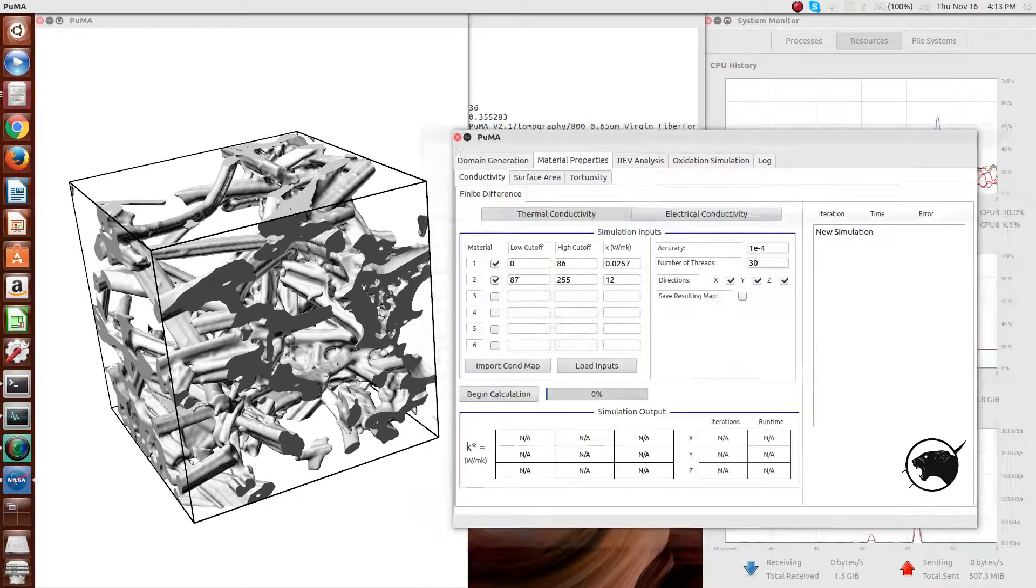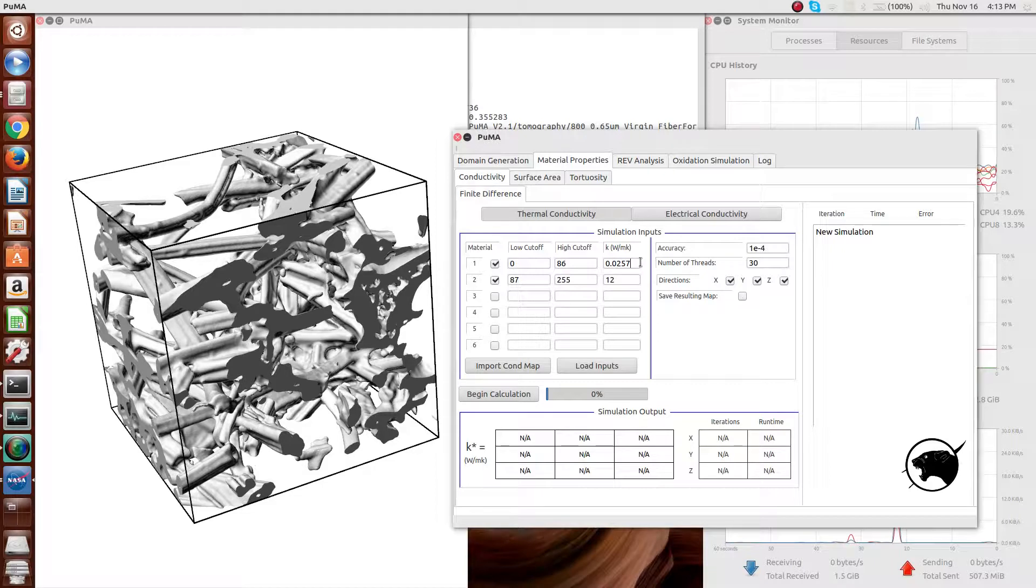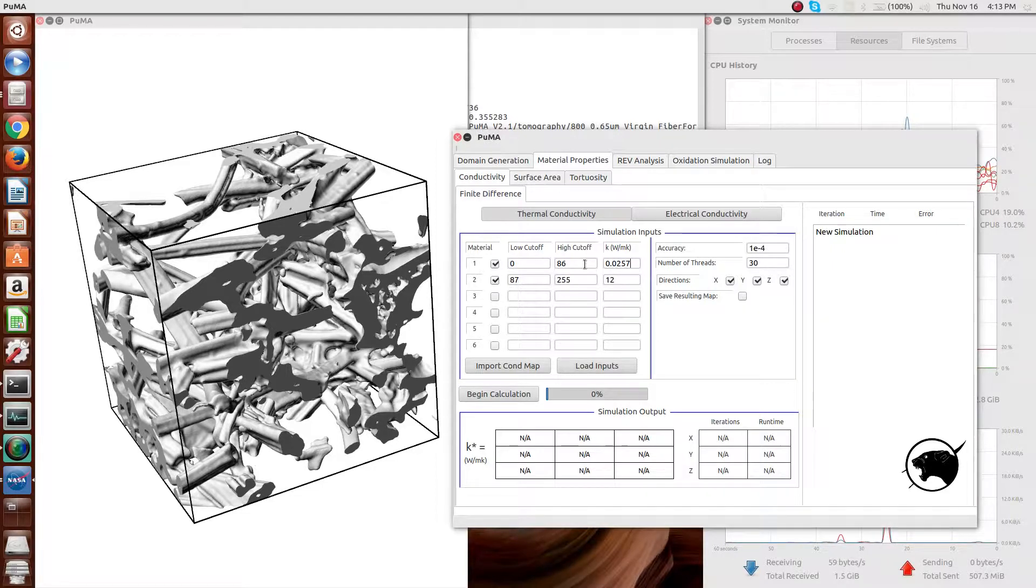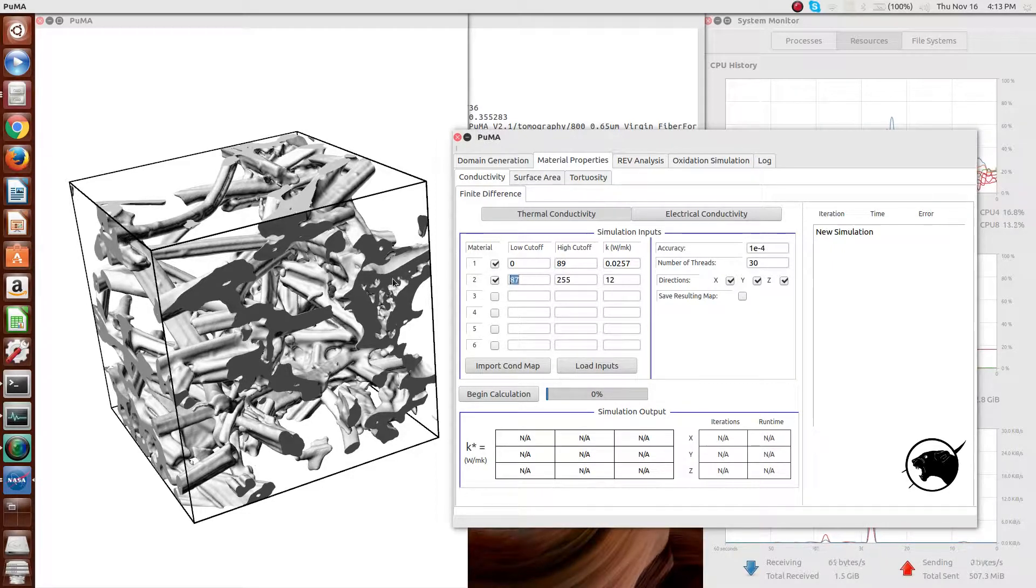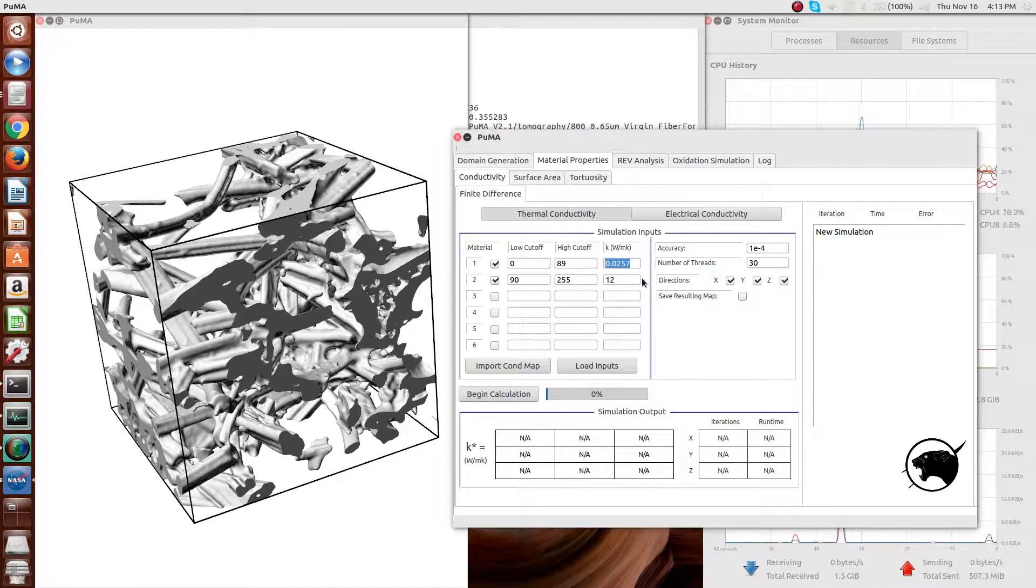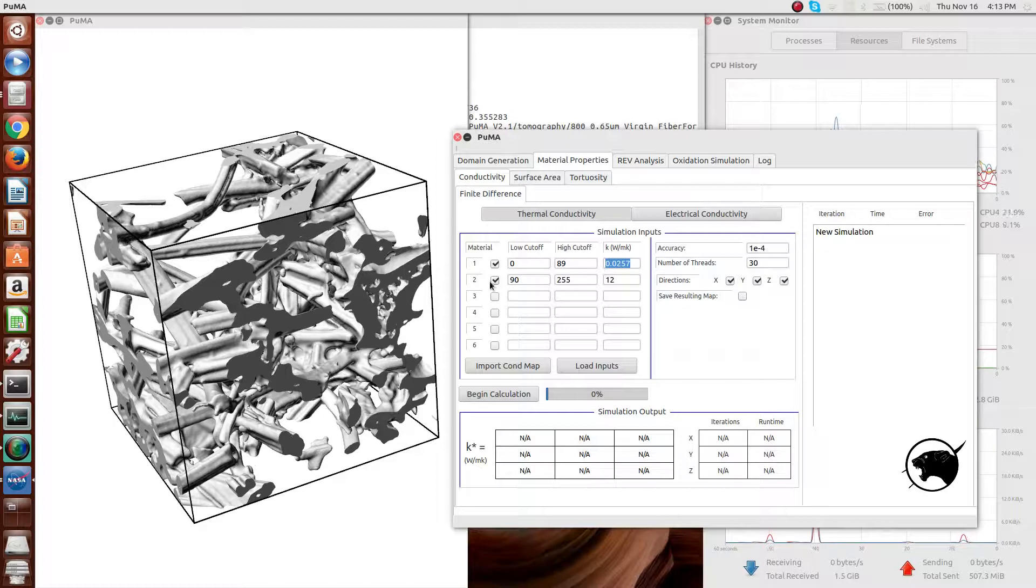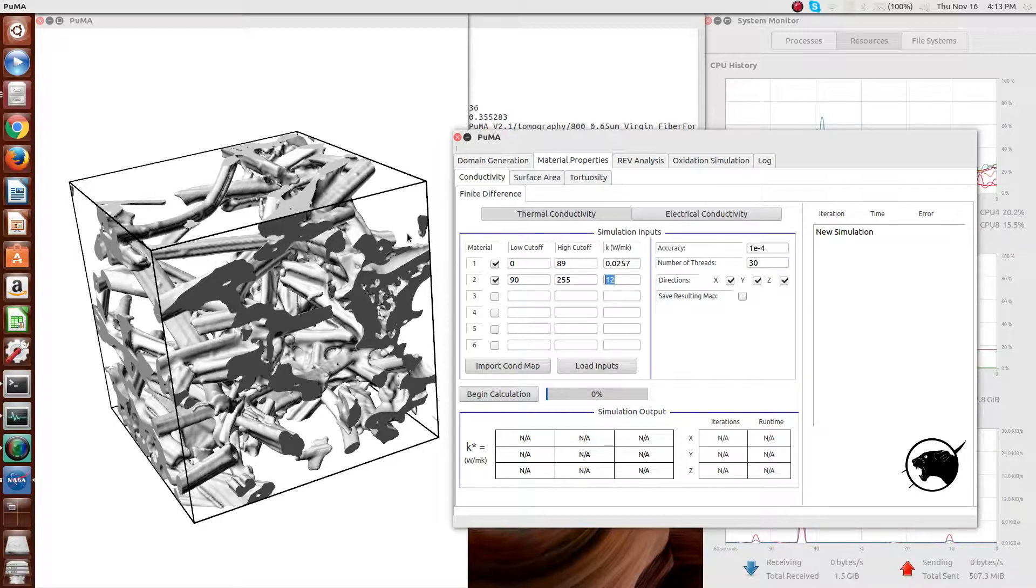In order to do this, you need obviously the microstructure, but you also need the conductivity values of the constituent parts. In this case, we're using 0.0257 watts per meter Kelvin as the thermoconductivity of the air and 12 as the thermoconductivity of the carbon.